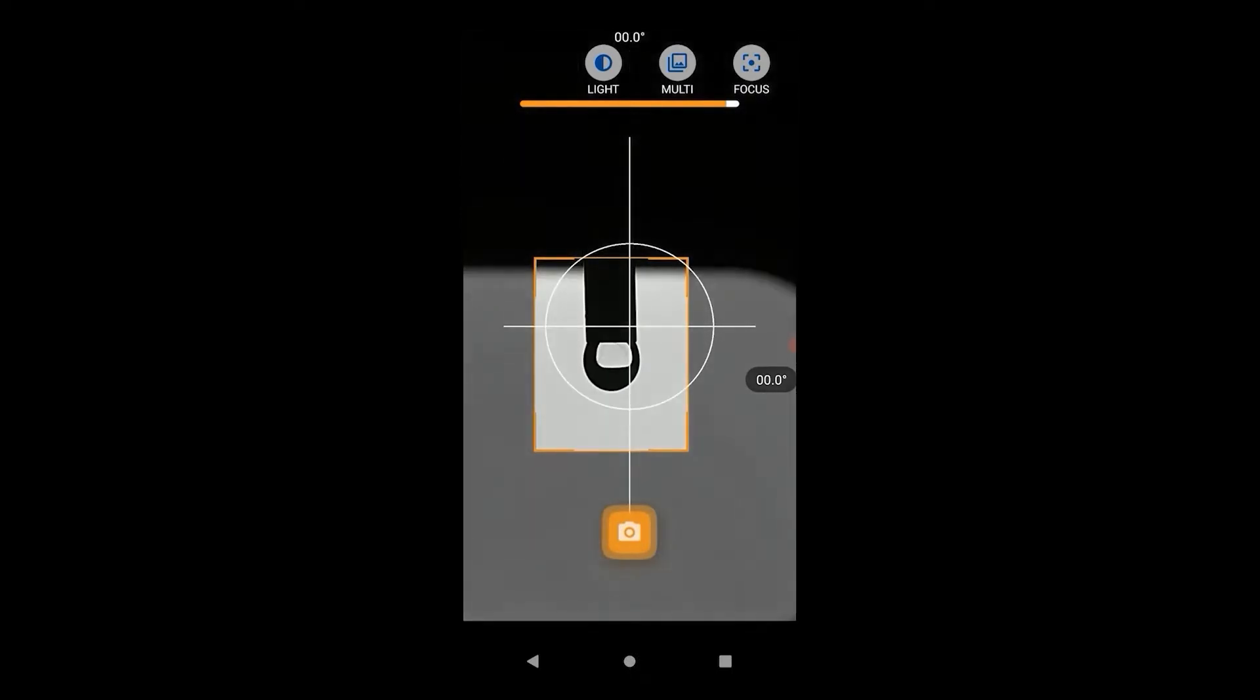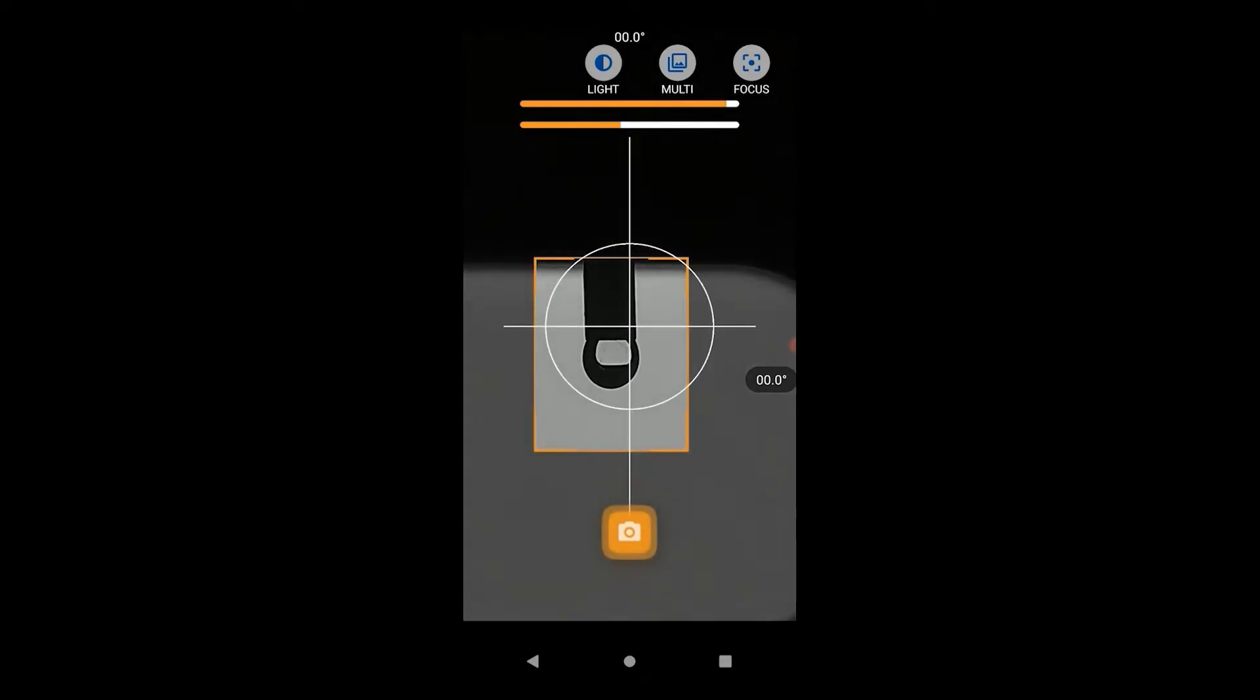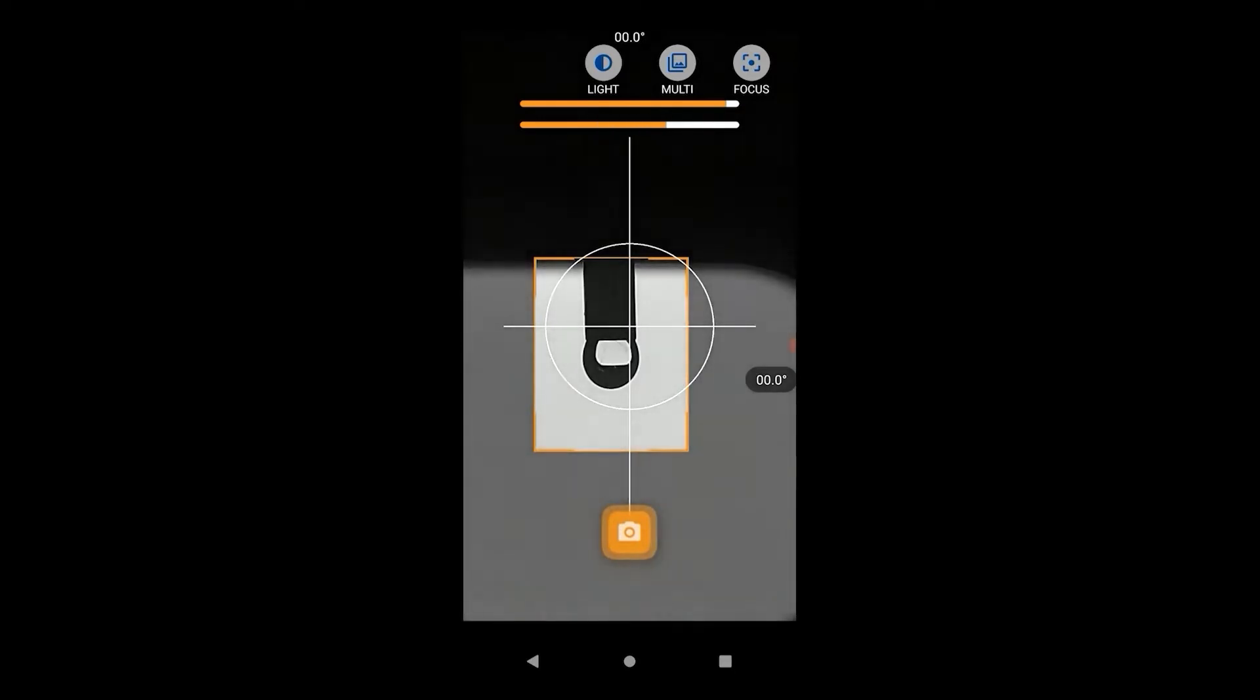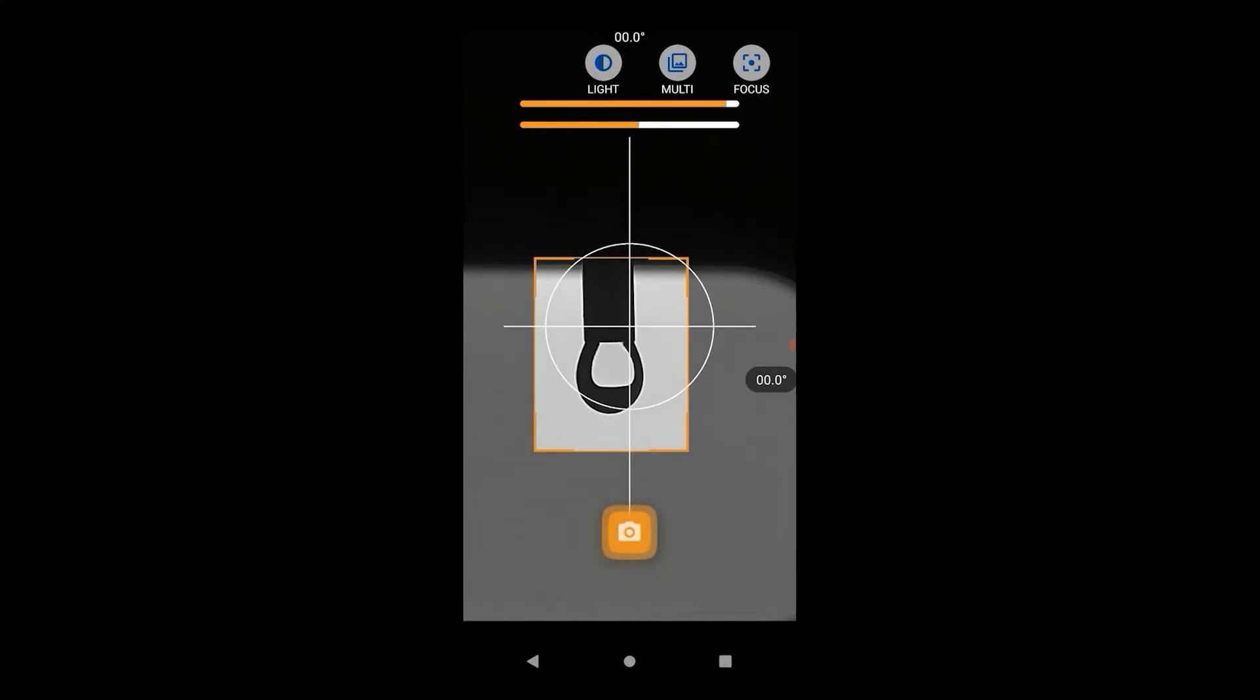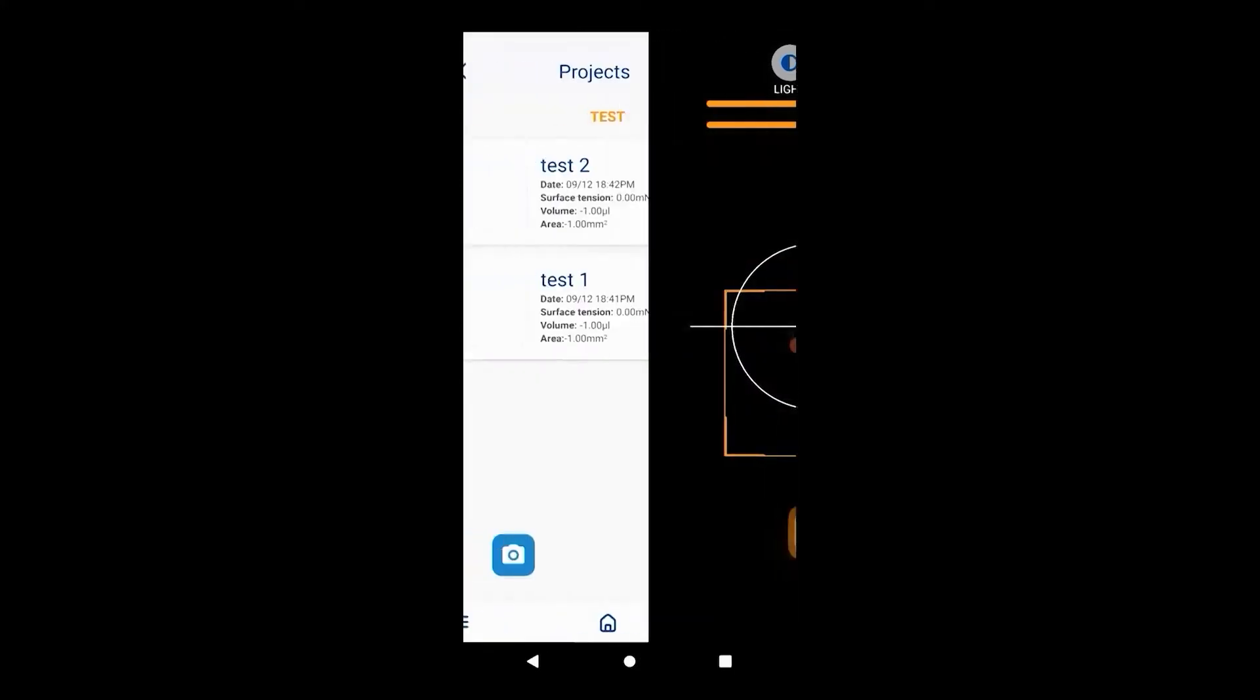Adjust the LED backlight and the phone's light to get the best possible contrast between the droplet and the background. Generate a droplet large enough that it is sufficiently deformed by gravity. A nice teardrop shape is recommended. It's best to aim for a droplet that's just about to detach from the needle.